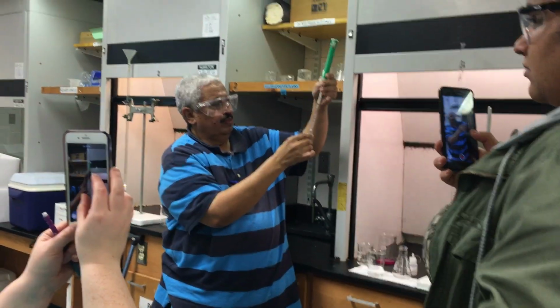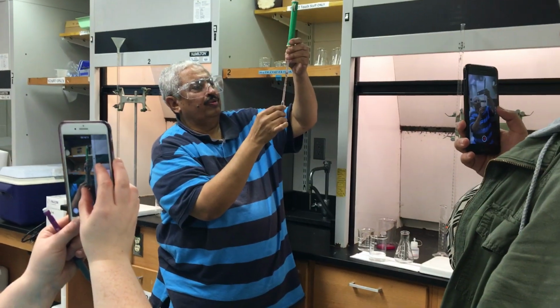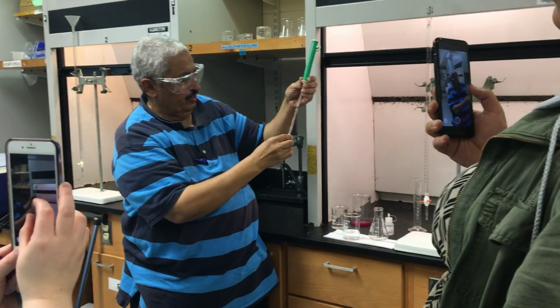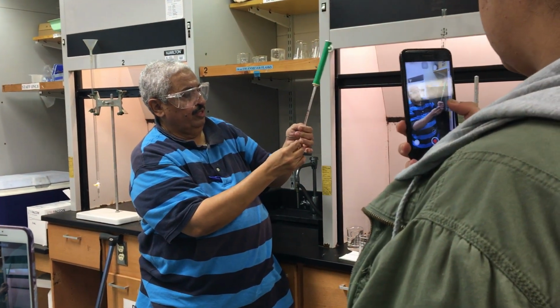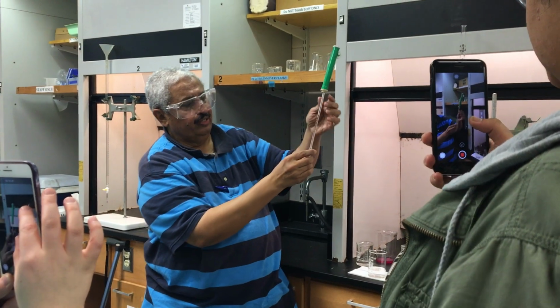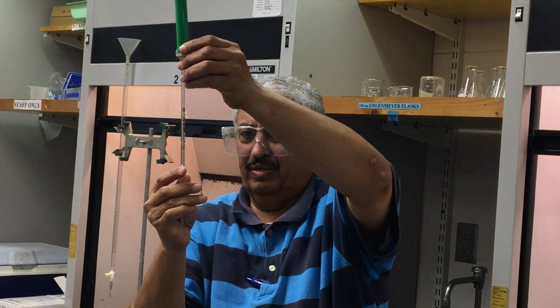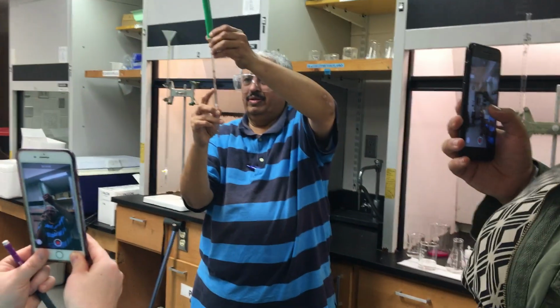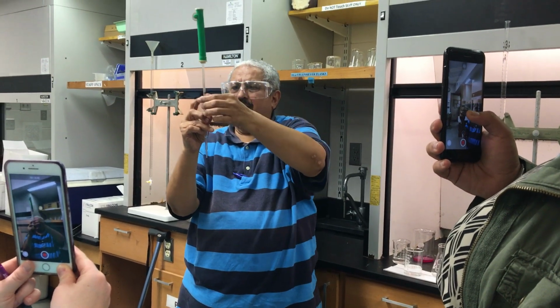1.2, 1.0. 2.0 is here. Let me see where's the line. It has too many lines. If you can visualize the lines there, it has too many lines, correct? So it has a number on each line. That's 1.3, and then it goes up, and this is 2.0. Here it is, the last one.